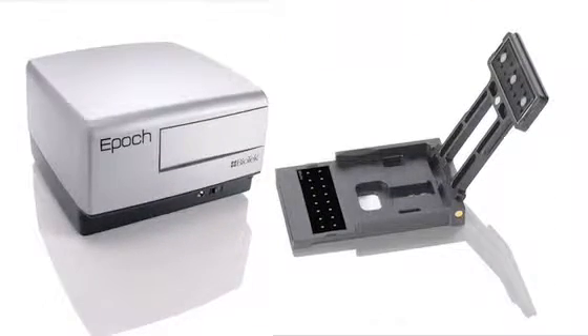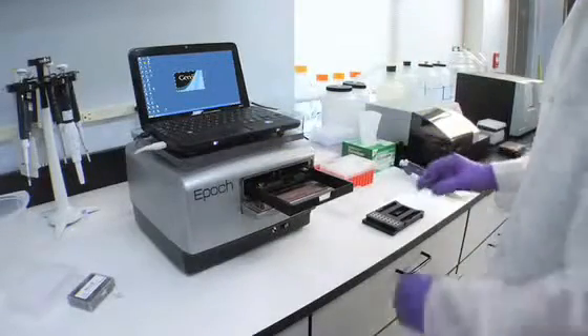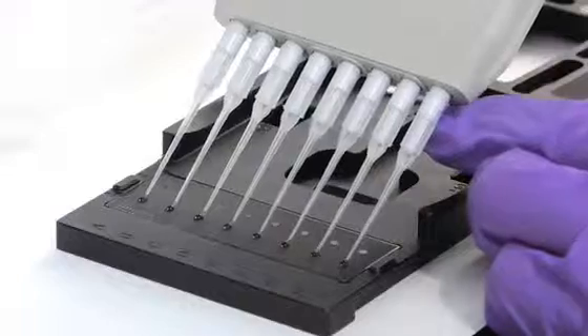We're going to use the Take-3 plate with the Epoch reader, a compact plate reader with a 200- to 999-nanometer wavelength range. Pre-programmed protocols in the Gen-5 software make it simple to choose the sample type and quickly obtain and calculate data from the Take-3 plate.